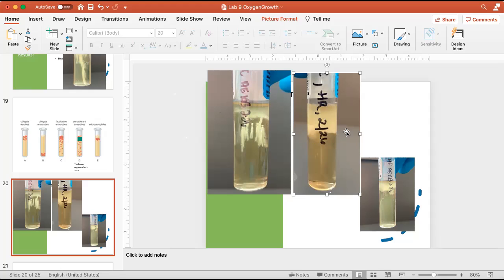Look at this tube. Is it the microaerophile? There's one other one, Vicky. Microaerophile does not like high concentrations of oxygen, so it would not grow up here. And microaerophile cannot grow down here. But there's one other category that this meets. Most growth in the oxic zone, but able to grow all the way down. Anybody? Facultative anaerobic. That's your facultative, right?